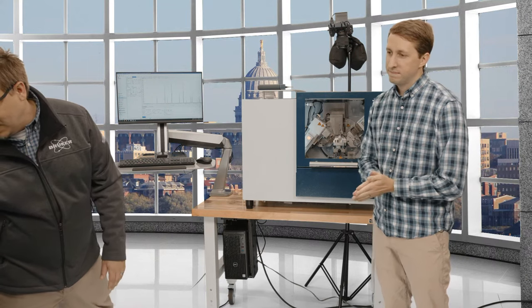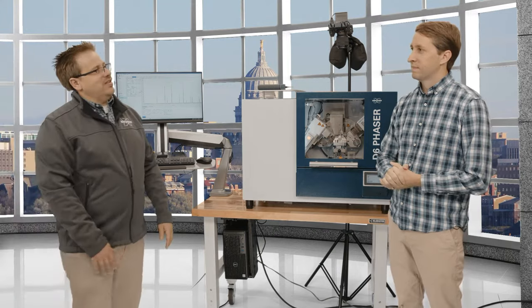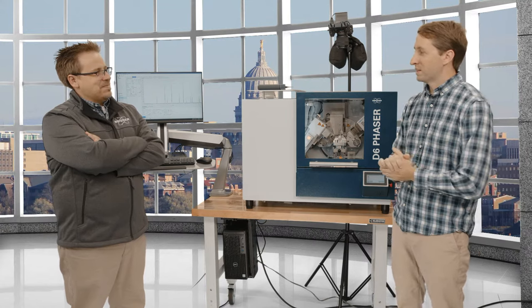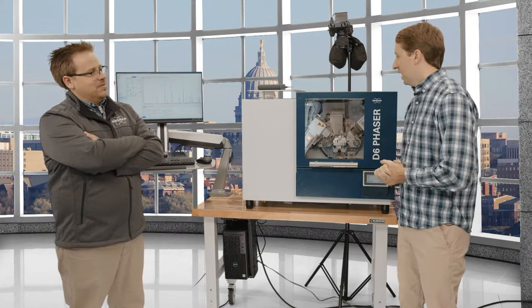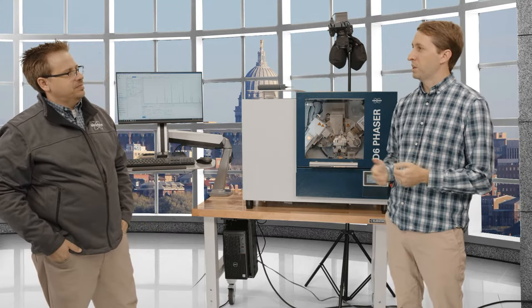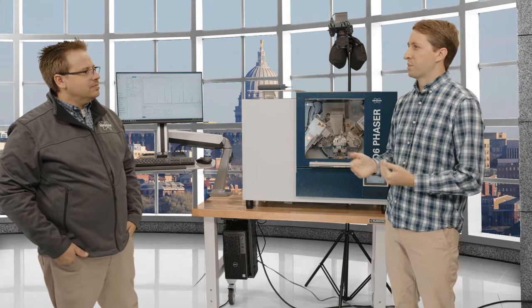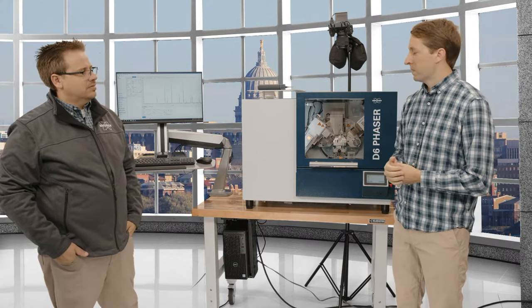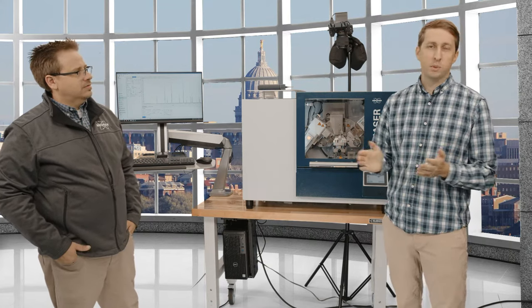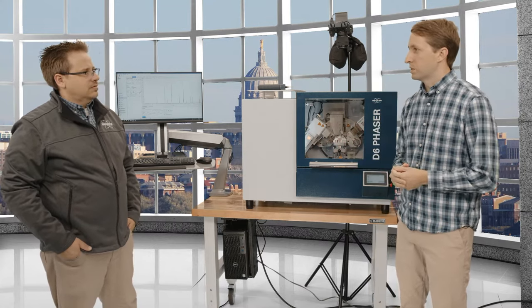Next question that came in, from Marilyn, is: what is the expected tube life? That's a hard one. That's always a really tricky question because the system is so new with the 1.2 kilowatts. So for comparison, let's talk about the floor standing models. Those are typically running at 1.6 kilowatts, and with normal usage, your average tube might last maybe 3 to 6 years. On the other end, the D2s running at 300 watts, those tubes would last the lifetime of the system. So we would say maybe 10, 15, 20 years for those X-ray tubes.